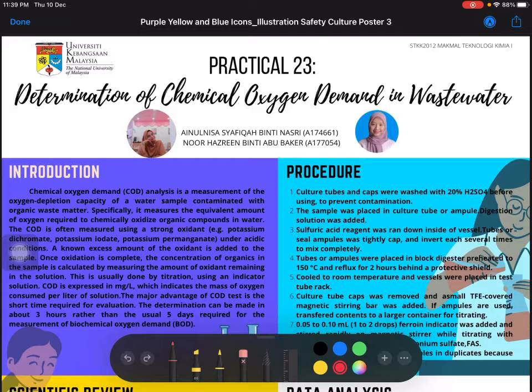Assalamualaikum warahmatullahi wabarakatuh. My name is Ainulnisa binti Nasri. My matric number is A174661. Today I'm going to present about Practical 23. The title is Determination of Chemical Oxygen Demand in Wastewater. Our group was able to find the COD and BOD data.